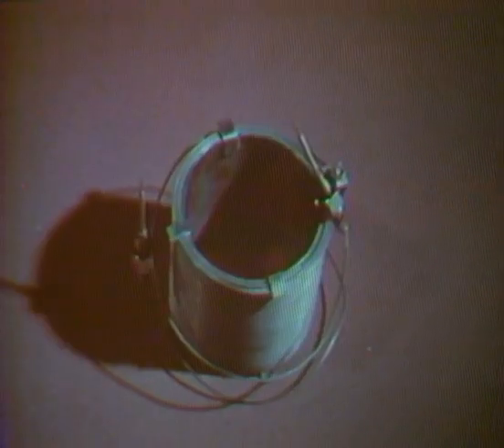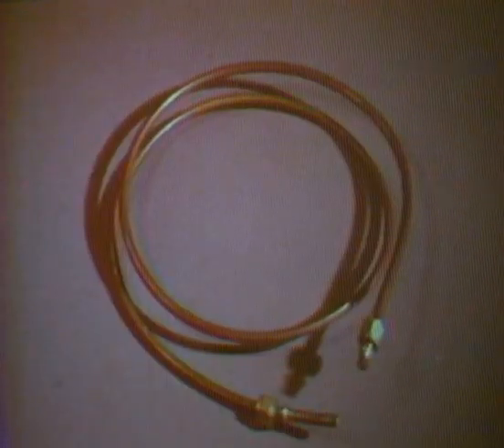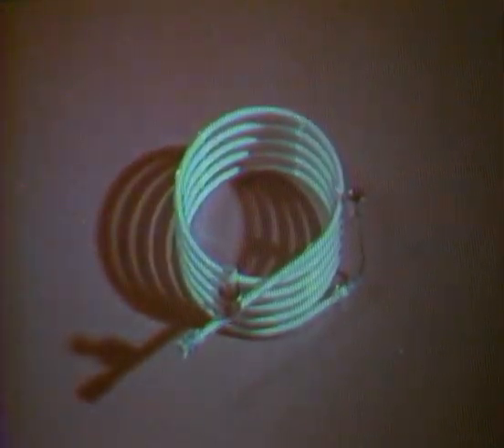Columns are used in all four types of chromatography. If the stationary phase is a solid material, its particles are packed into the column. If the stationary phase is a liquid, it is first coated over solid particles of an inert material that supports the liquid stationary phase. The mobile phase, flowing through the column, carries the components of the sample.